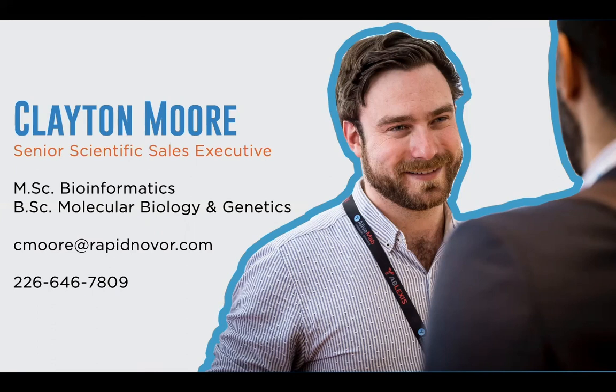Okay, great. Another question is, can we handle samples that contain impurities? Yes. In terms of a purified antibody, we need something that's been relatively purified. As long as we've got about 80% of your actual antibody of interest, then we can work with that.